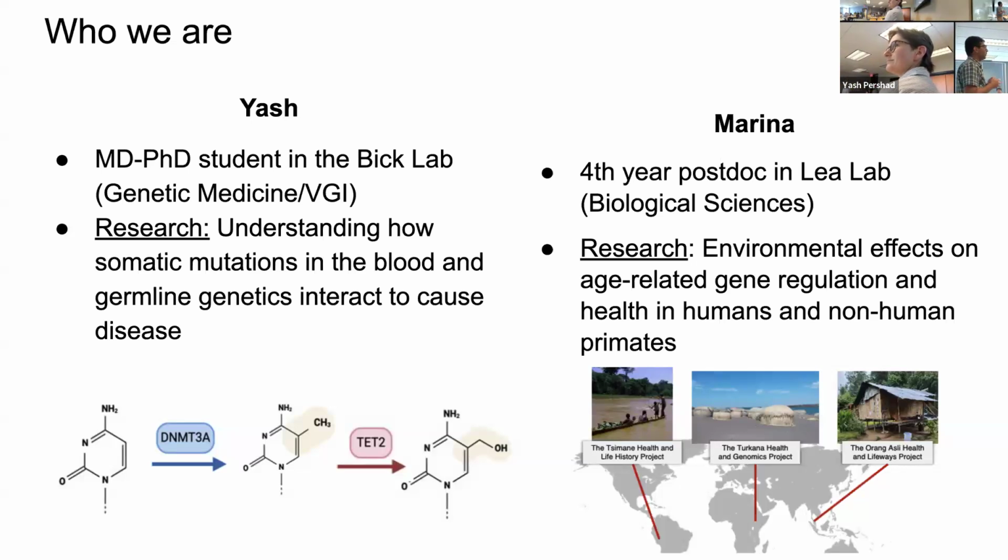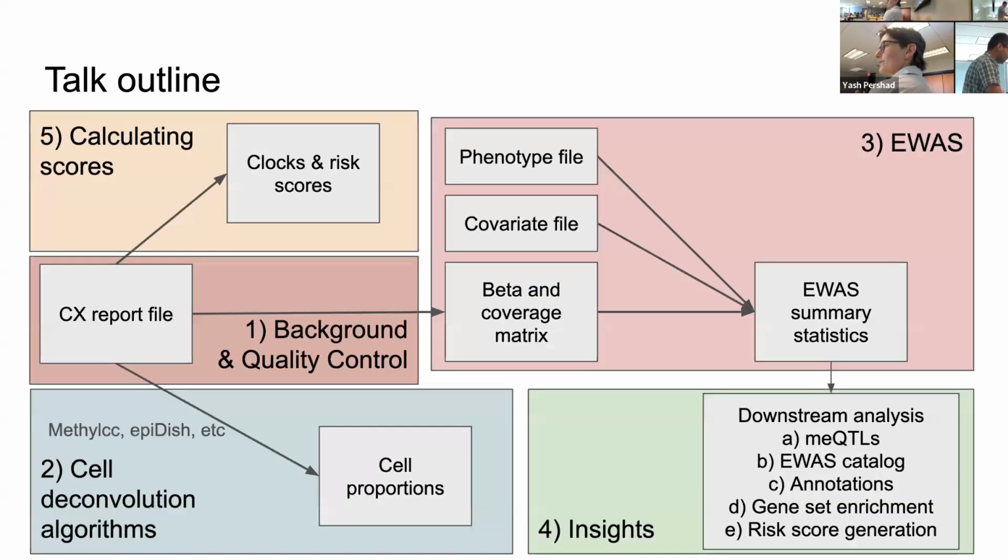If you don't use that, you can at least look at the R script and the code that underlies it if you run it locally or on Acre. And then Marina kindly made a little tutorial for us, so it was great.